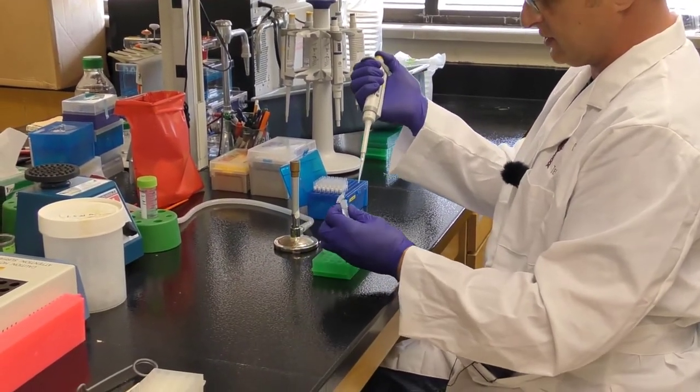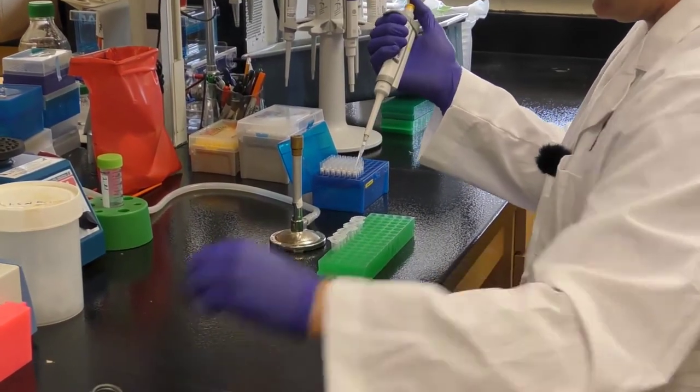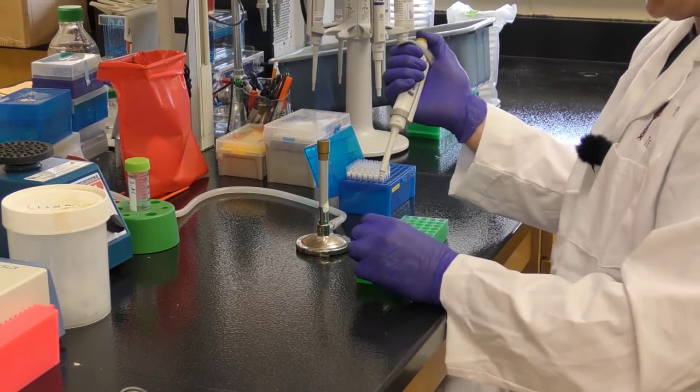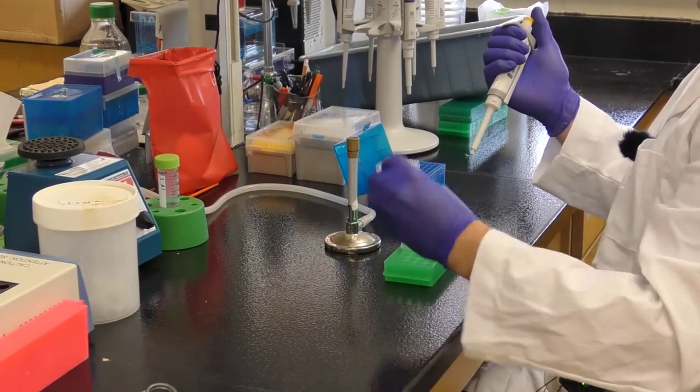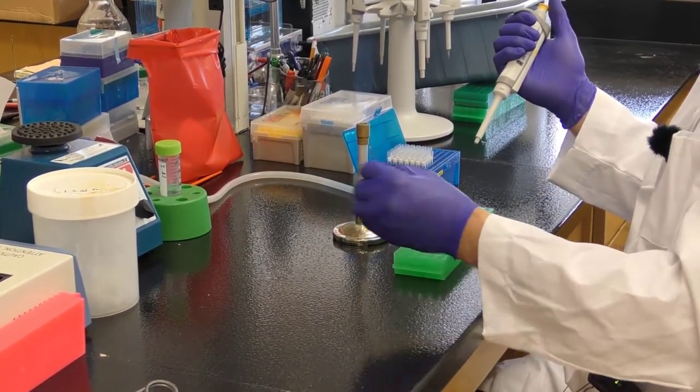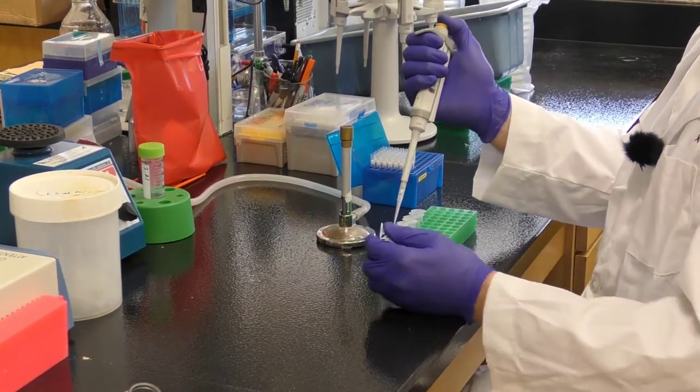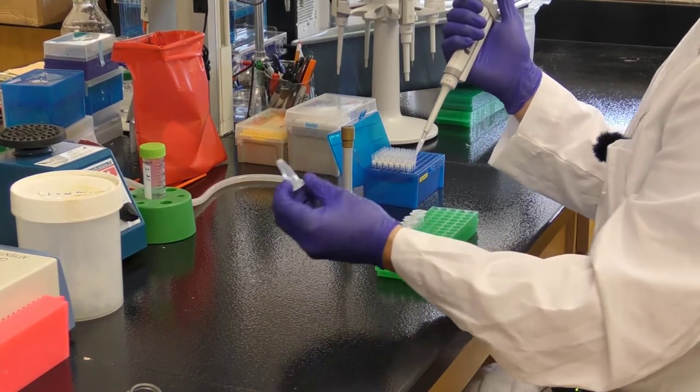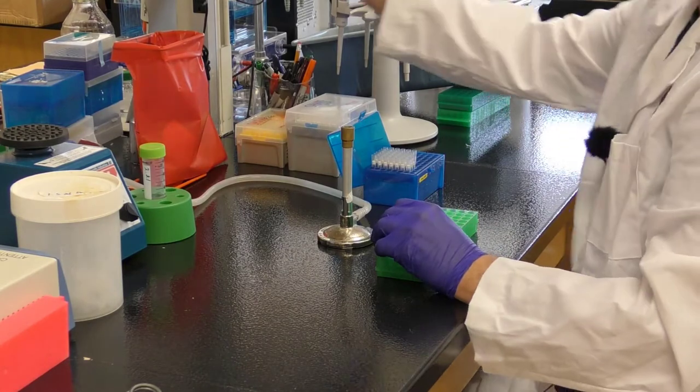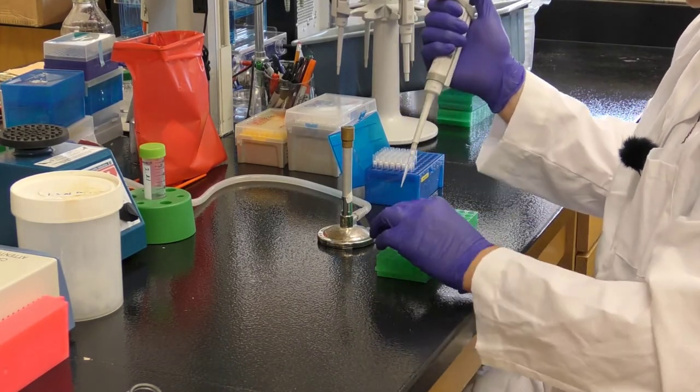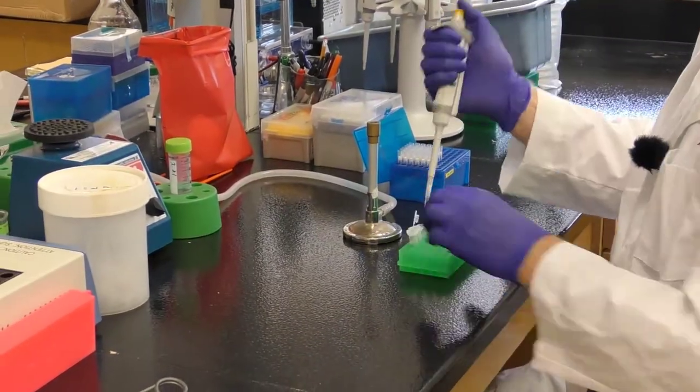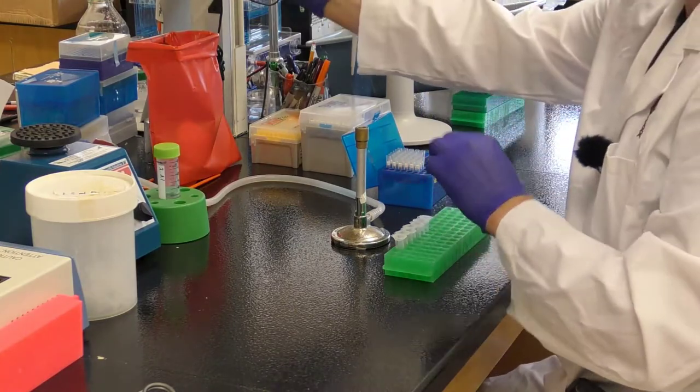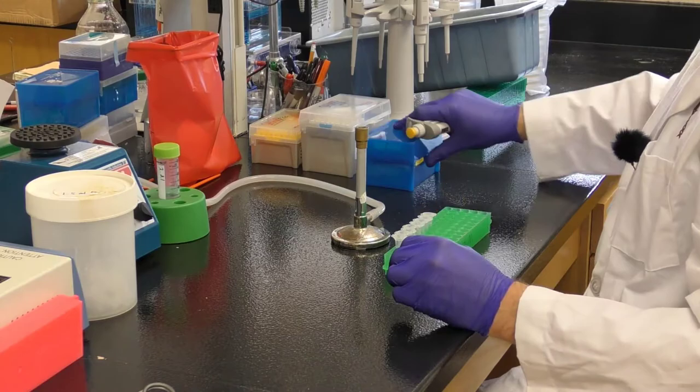I will take, this is my undiluted phage sample. We'll take out 100 microliters, place it into my 10 to the minus 1 tube. Notice I pumped up and down a couple times to make sure that I washed the pipette tip. Then I will briefly vortex, and I place that tube now to the left. That's the first serial dilution done. The second serial dilution comes from the first serial dilution in exactly the same way, pumping up and down a couple times. Quick vortex and that's the second serial dilution done. And we just continue in the exact same way all the way through. And that is our serial dilutions complete.